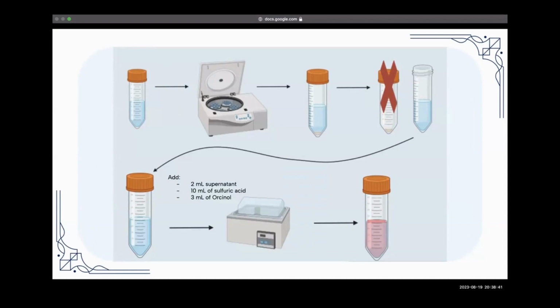And when it precipitates, the xyloglucan will bind to it and precipitate with it. So when we centrifuge it, as you can see, there's a pellet on the bottom. In the pellet, there's the xyloglucan and CNC, which have bound together. And in the supernatant, we just have the remaining xyloglucan. So in our experimental procedure, we only need the supernatant, and the pellet will be discarded.